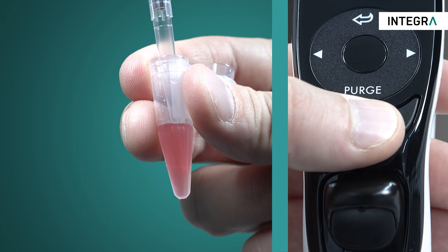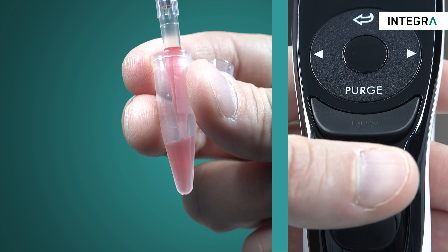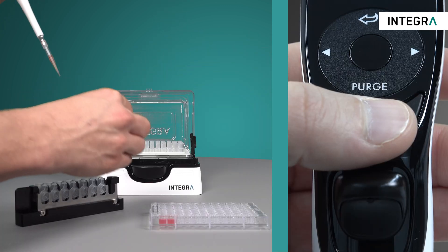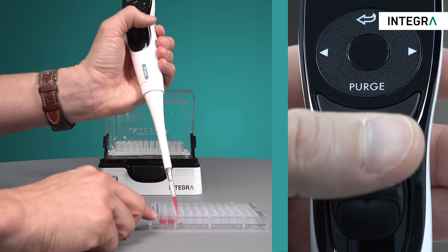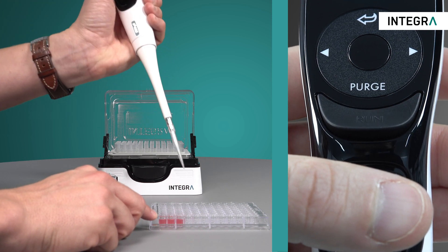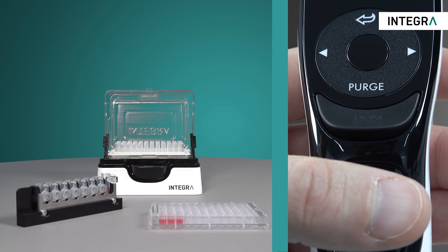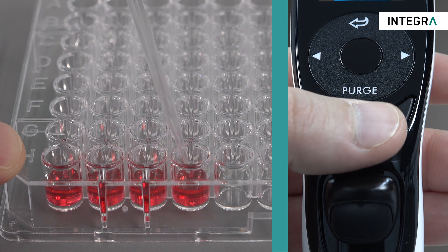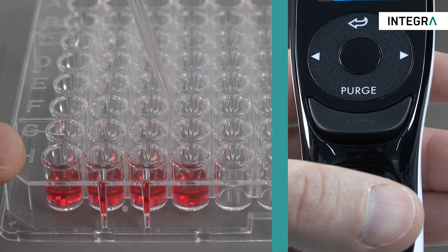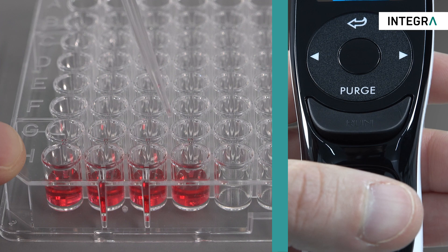When you're ready, simply aspirate your liquid by pressing the run button and dispense by pressing the same button again. An automatic blowout follows the dispense, ensuring the full set volume will be delivered. By holding the run button, the blow-in can be delayed until you're ready, to avoid accidental liquid intake or to give you all the time you need to perform a touch-off.